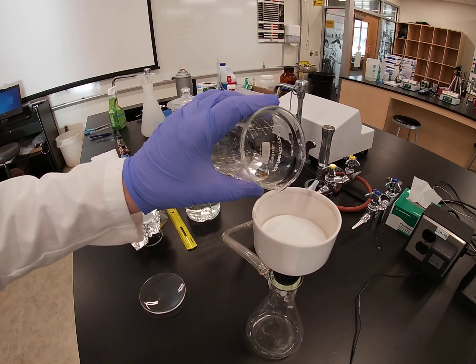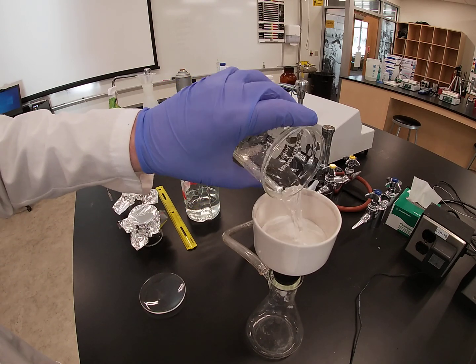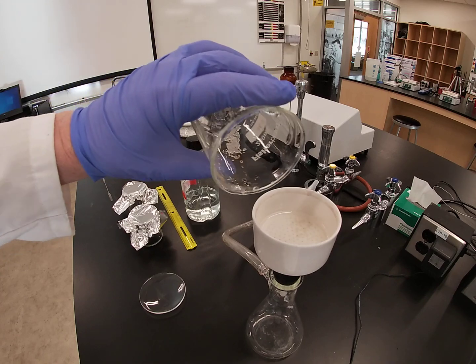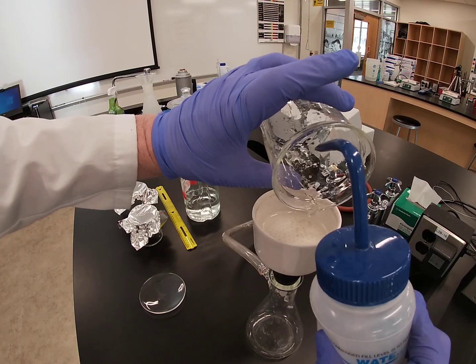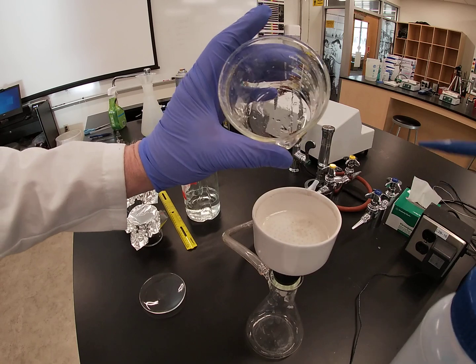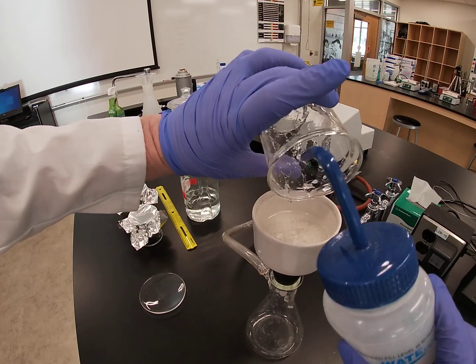and by so doing, hopefully separate some things. And the amount of water I'm using doesn't really matter on this one, although if I get too much it's going to be really hard to evaporate it, which is our last step here. So we pretty well want to rinse everything out of there.